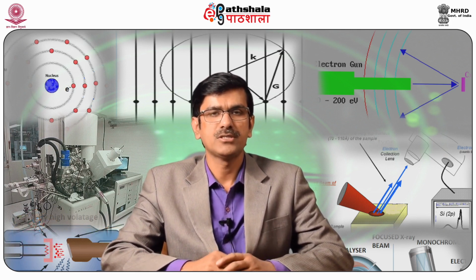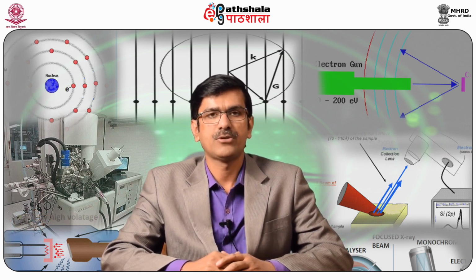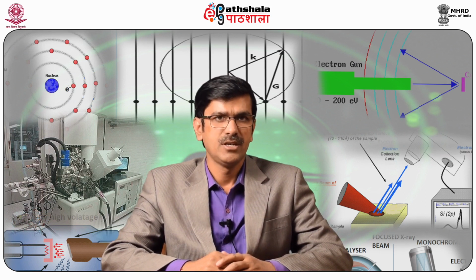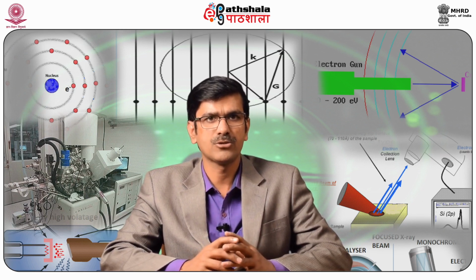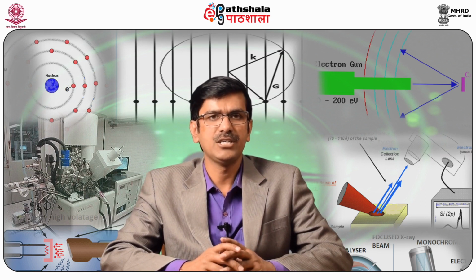Today we are going to discuss the module X-ray photoelectron spectroscopy. In this module we will discuss the instrumental part, how the instruments are assembled for the photoelectron spectroscopic technique. This is under the paper of surface analytical technique 2.